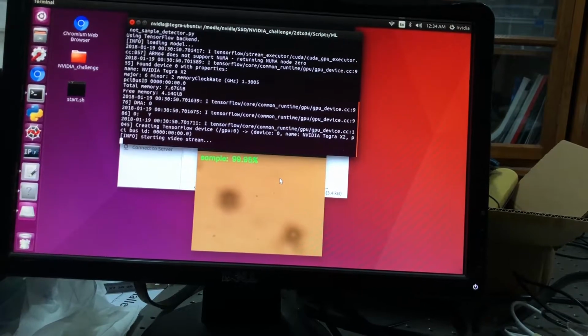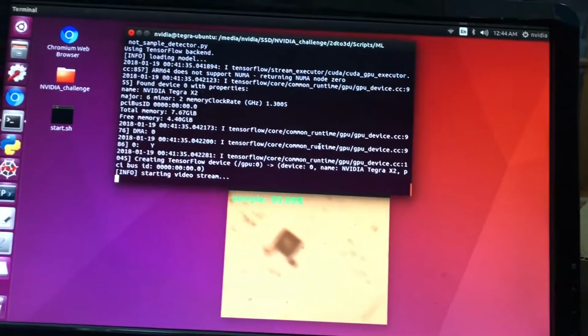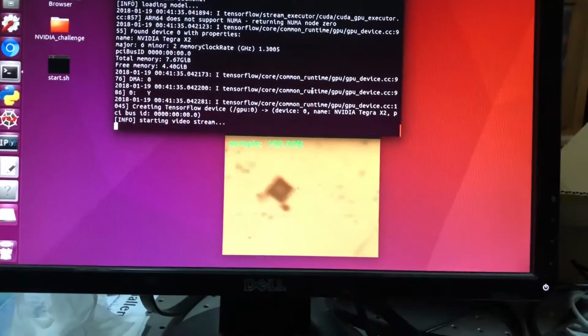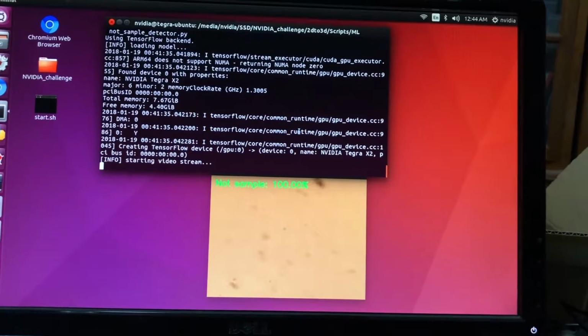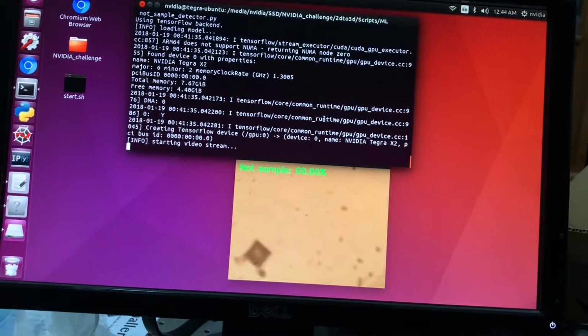From finding microstructures on the slide, we proceed to identify which is a sample, because the slide may contain errors. Later on it will tell us what kind of sample it is, so we can definitely draw a precise model of our 3D structure on the slide.